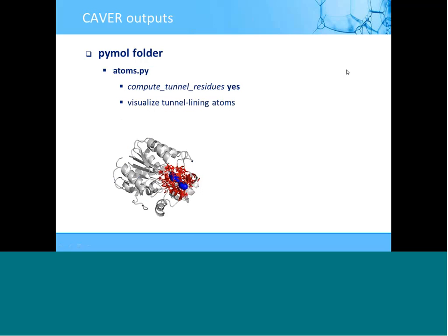And finally, related to PyMOL, if you set compute tunnel residues yes, you will get atoms py, and this allows you to visualize the tunnel lining atoms of the respective tunnels.